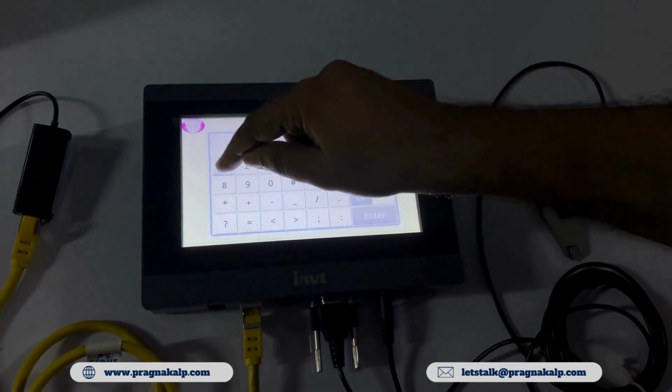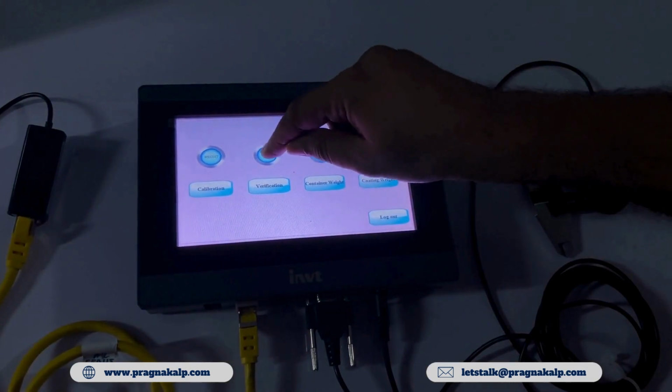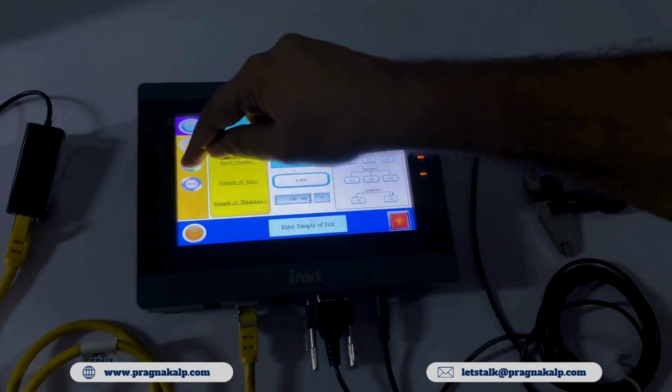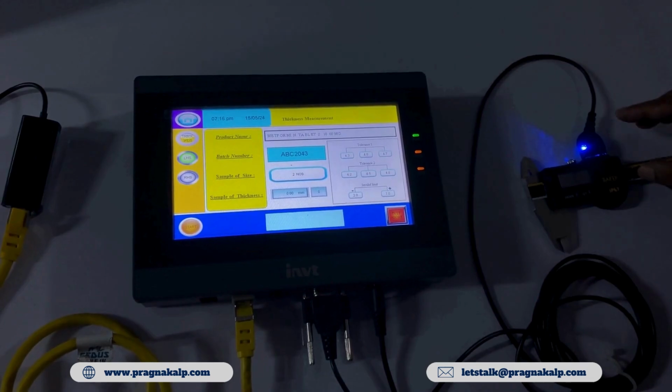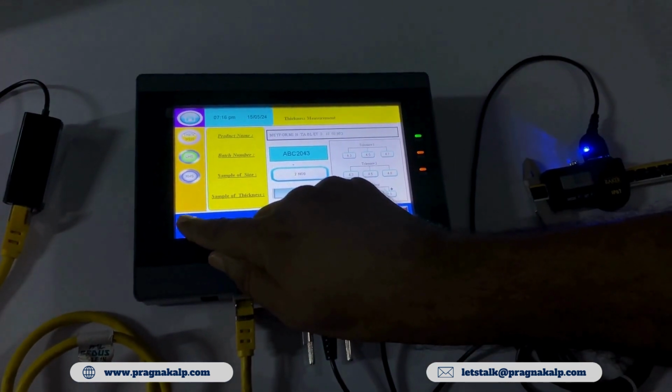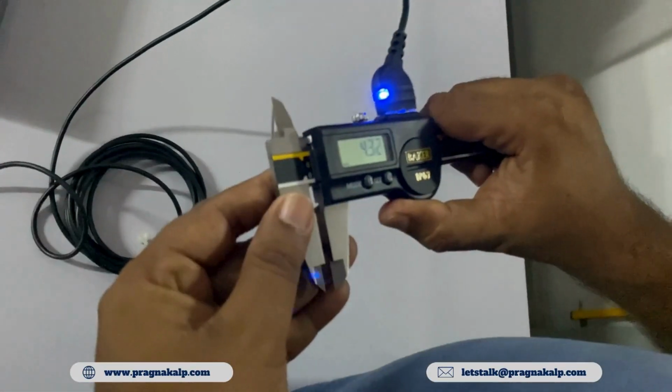You will see a list of parameters. Select the parameter that you want to perform. The batch number, product, and product parameter specifications will be displayed as configured. Please select the rotary side, enter the sample size, and start the process.